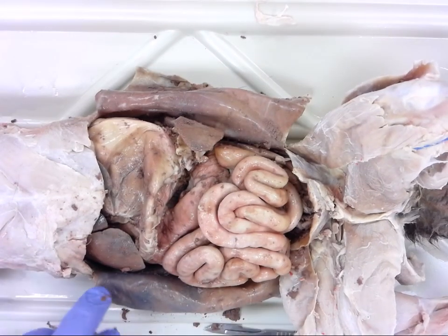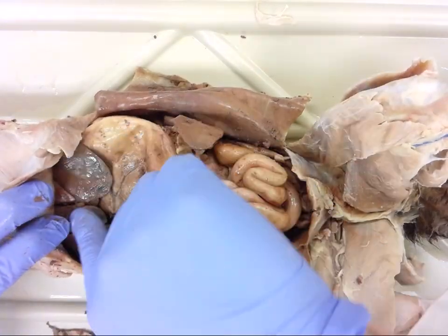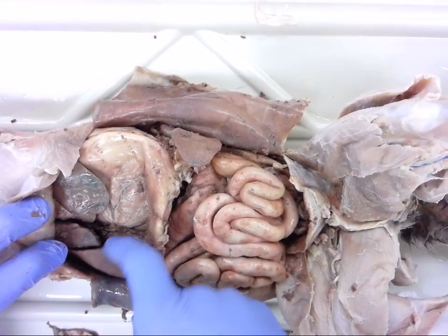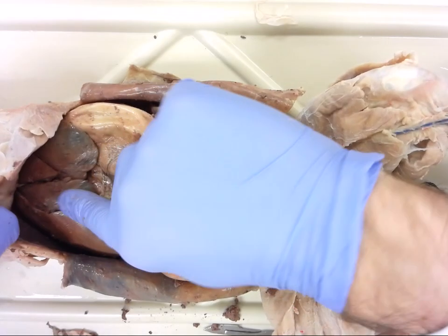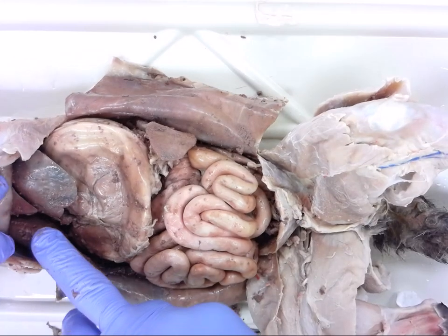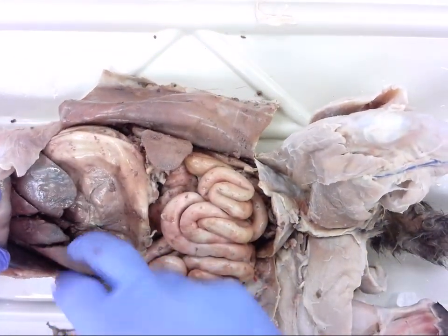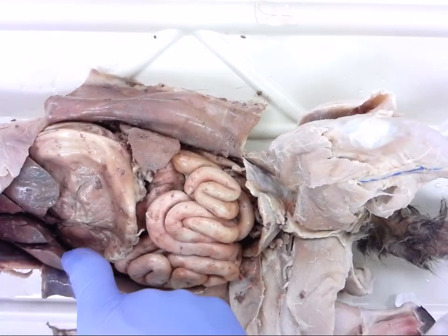Some of your accessory organs you'll see here. If we lift this up a little bit, you'll see the variety of lobes of liver here. This one does not appear to have a great, at least from this view, a great gallbladder. I will try and find a good example of it for when I do the accessory organs, so that I can identify it. But it sits up in between the lobes of the liver.